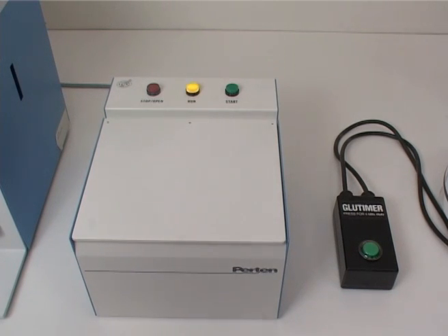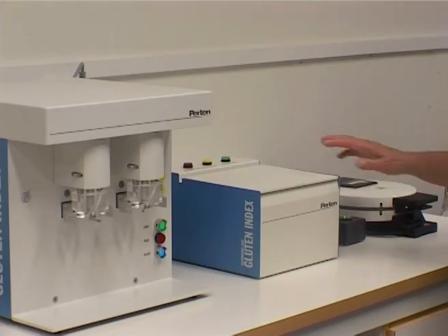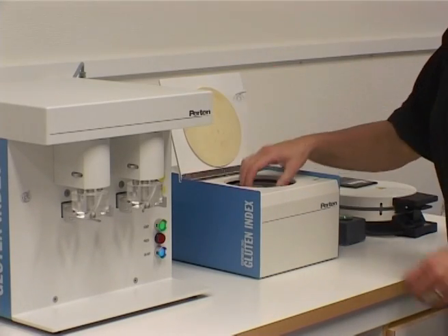After 60 seconds the centrifuge stops and signals the completion of this step. Remove the cassettes.